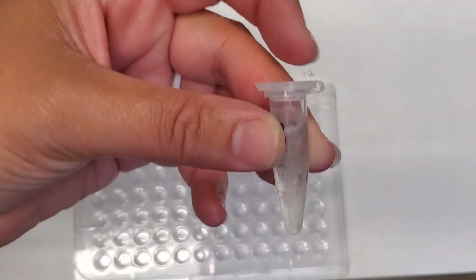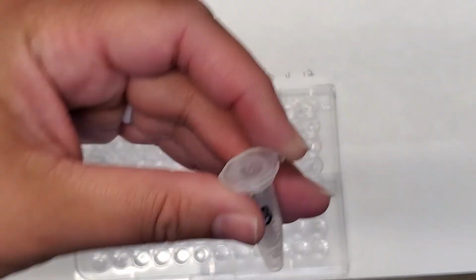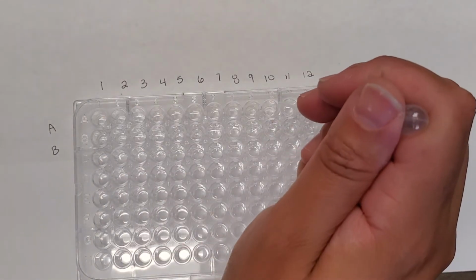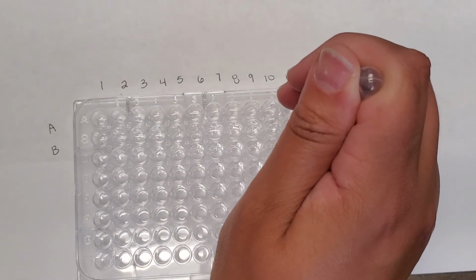Now that we're done with patient A, we're going to move on to patient B. So patient B is our second patient that we're actually testing. And so we want to make sure that we get their test results also correct. So this time we're going to add it into row A, wells 10, 11, and 12.